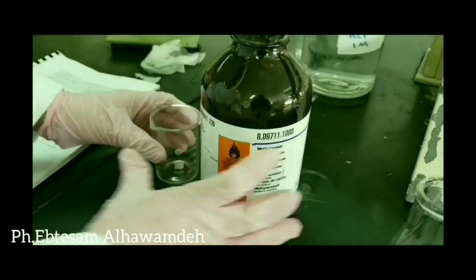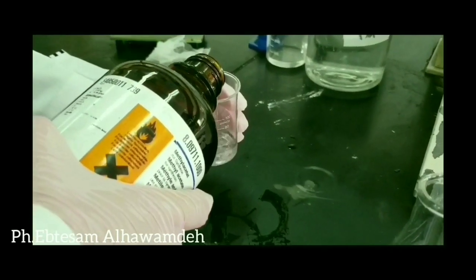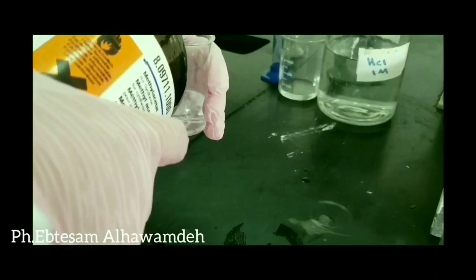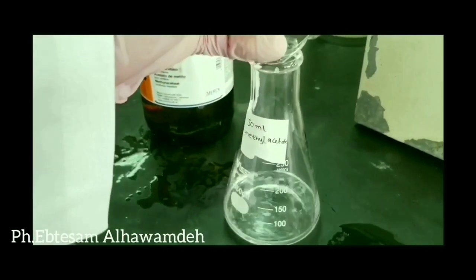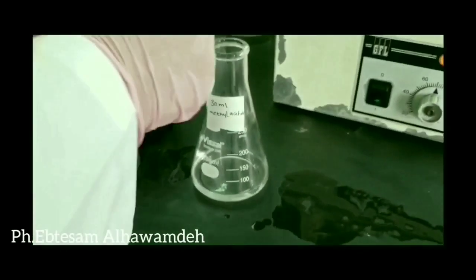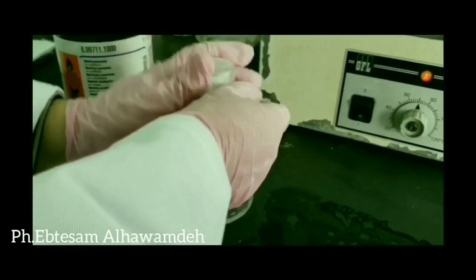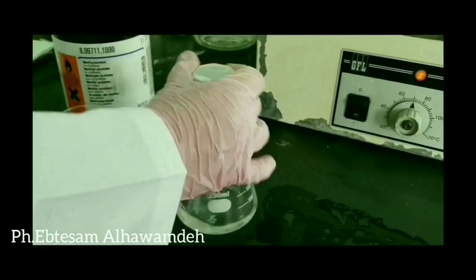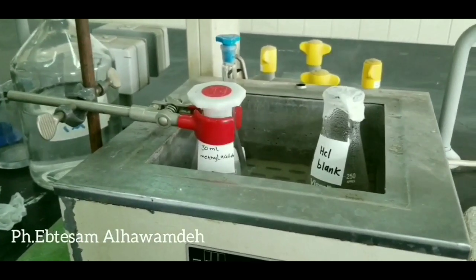By using a flask, take around 30 ml of methyl acetate, roughly measured, and place it in the water bath at the same time. Allow both to come to thermal equilibrium, about 15 minutes.